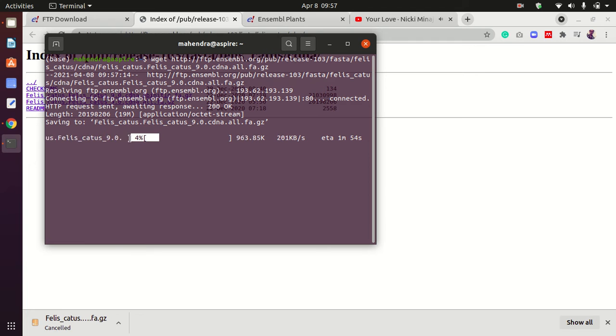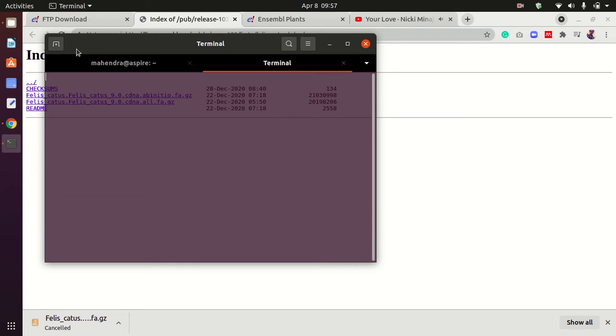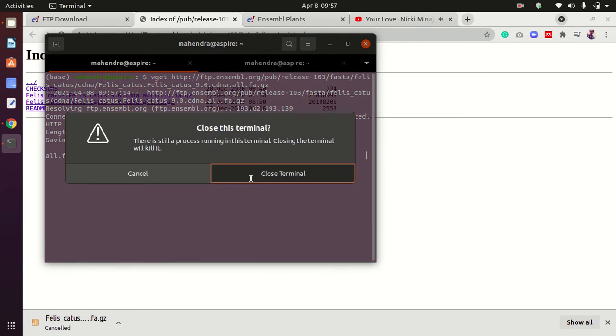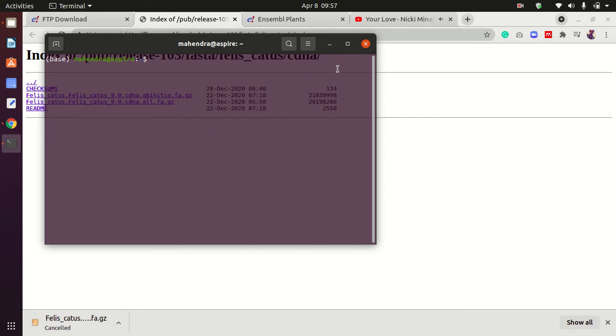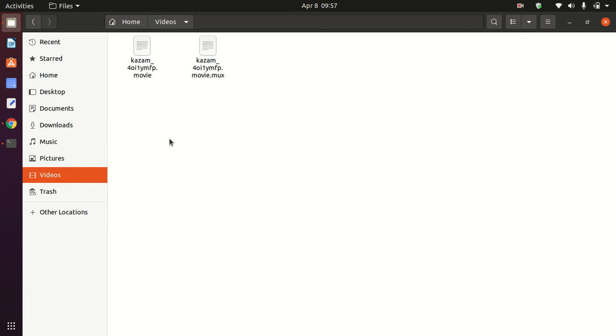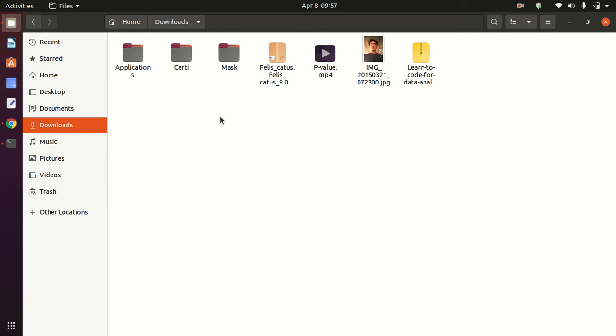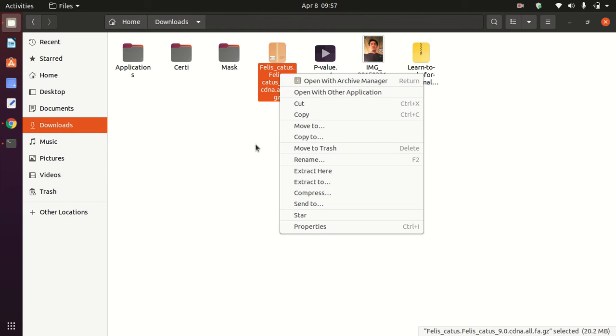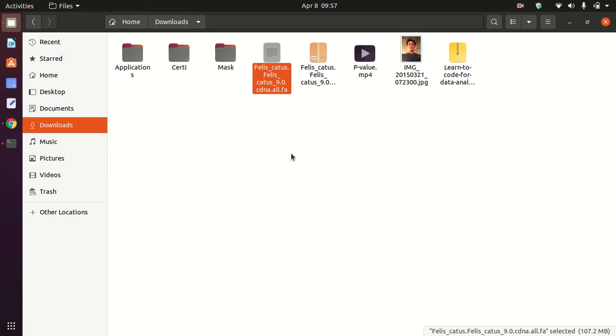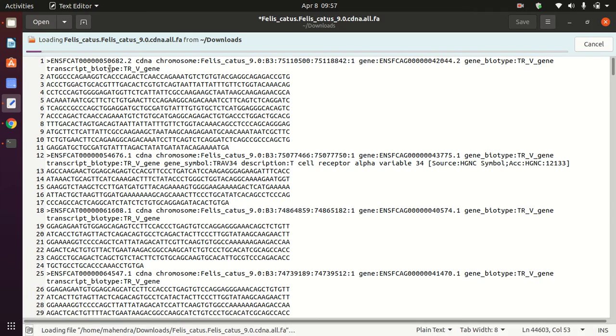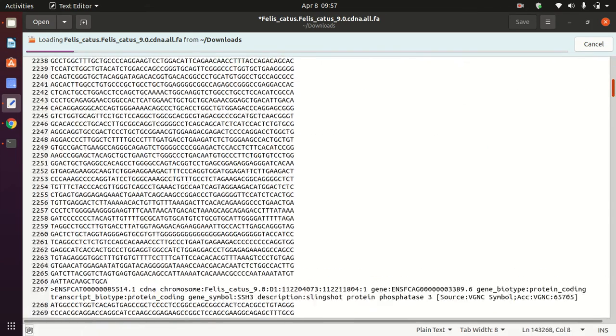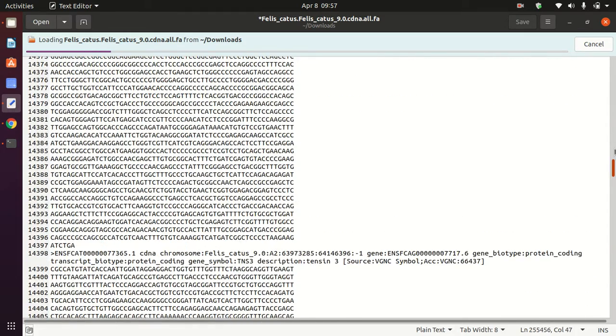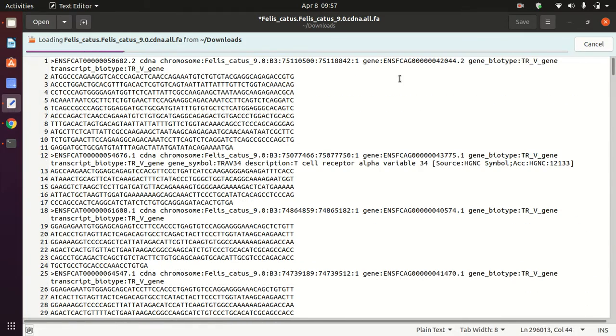You can see here it's downloading. I'll just stop it because I've already downloaded these files. Now I'm going to show you what the files look like. Just extract it like this, and now I have a FASTA file.